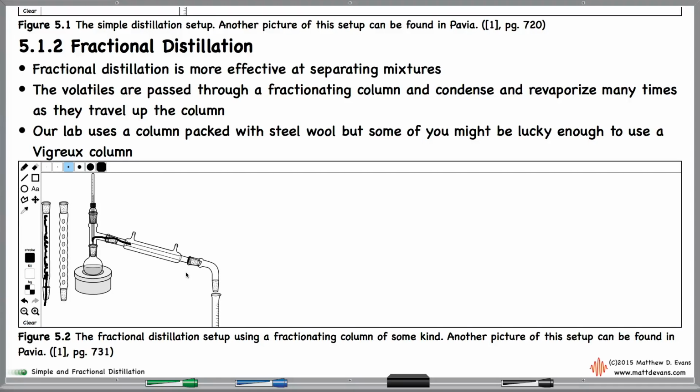And once again, you're monitoring the temperature the whole time, and you're monitoring the distillate collected. As a reminder, you need to collect at 4 milliliters of distillate collected and also 20 again. So in the end, after 2 weeks worth of work, you're going to have 4 samples that we're going to analyze by GC. GC stands for gas chromatography. That's going to be the ultimate proof as to how well this separation is.